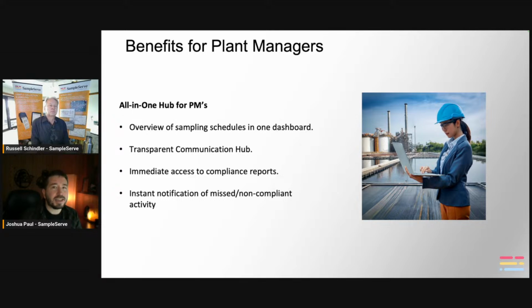Let's say it's a holiday, and you're not going to need that big long list of samples. You're only going to be taking a bacteria that day because you're going to have limited staff available. You can go into that specific day and you can change that work scope just individually and have that not affect anything else. It's kind of like, once again, a Google Calendar thing. Would you like it to affect this event or all the following events?